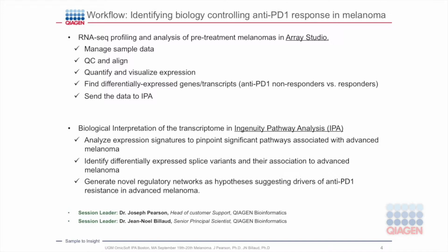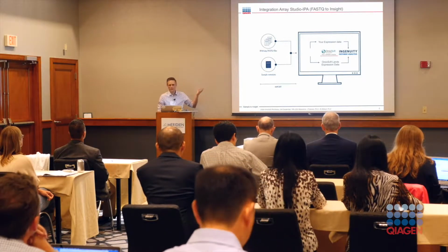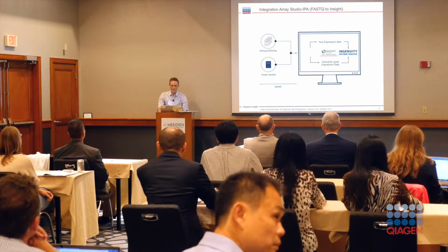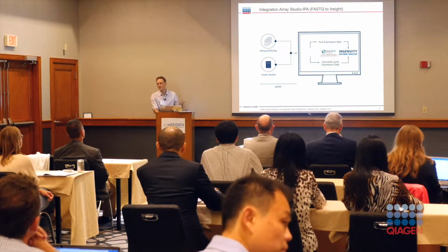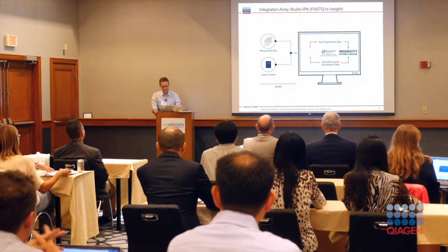The overall goal in the initial integration between Omicsoft and QIAGEN has been integrating ArrayStudio to Ingenuity Pathway Analysis. What this means basically is that even if you have your own expression data, your own RNA-Seq or microarray data that you've analyzed within ArrayStudio, or if you want to take data that have been pre-processed and are available in DiseaseLand or OncoLand, and you want to explore these data further in IPA, it's only a click or two away, basically.